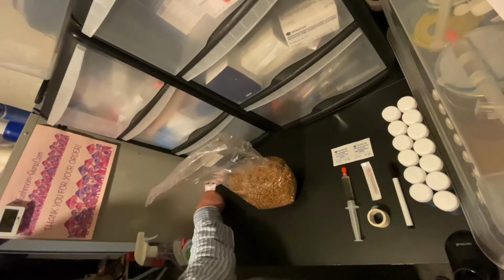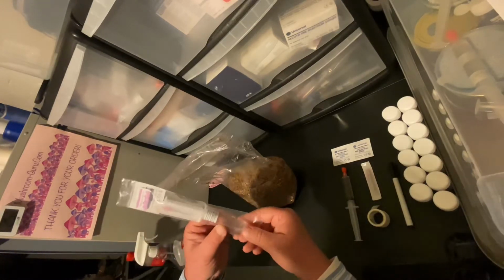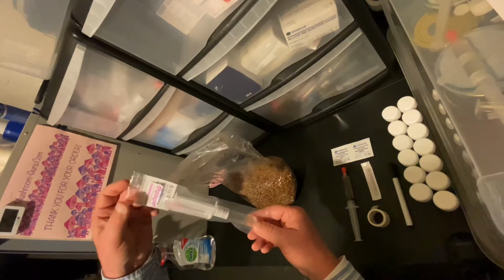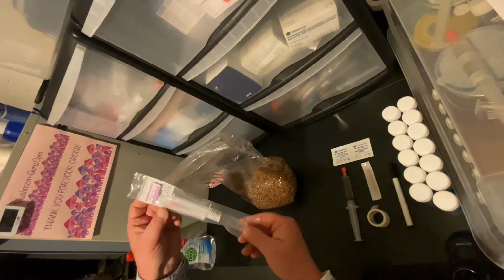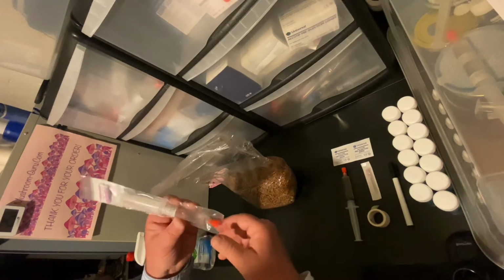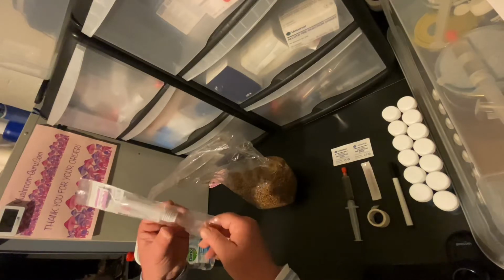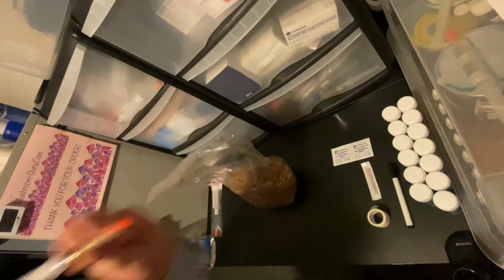So your culture will come like this. It consists of an alcohol pad to clean the area where you're going to insert the needle itself, 18G, and of course the culture. Now the culture, before you use it, very important, you want to shake it.